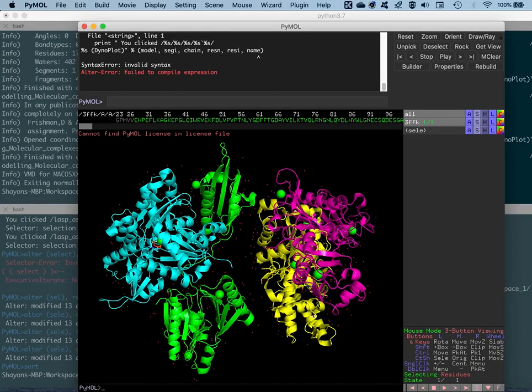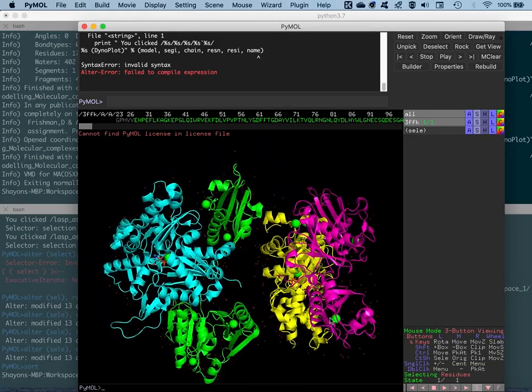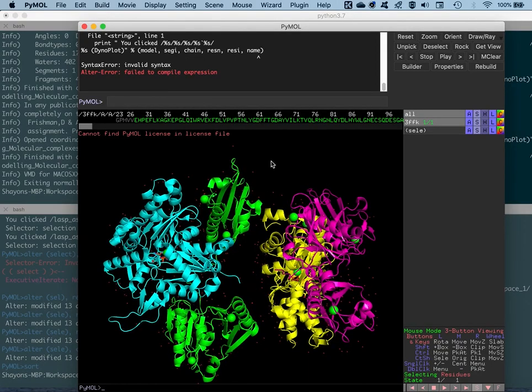Whereas in case of the gelsolin actin in the other subunit, you have the gelsolin colored in purple, whereas the actin is colored in yellow. So these are all the representations in chain coloration. And you'll find the same representation in the sequence as well. So the A chain is colored in green again, and if you go down further along the sequence by using the scroller out here, you'll find that the chain B has a different color, and then further chain C is colored in, chain D is colored in purple.